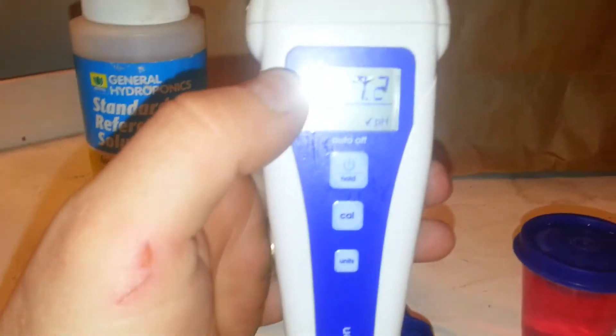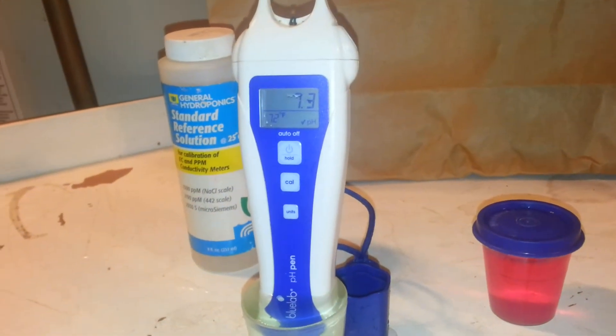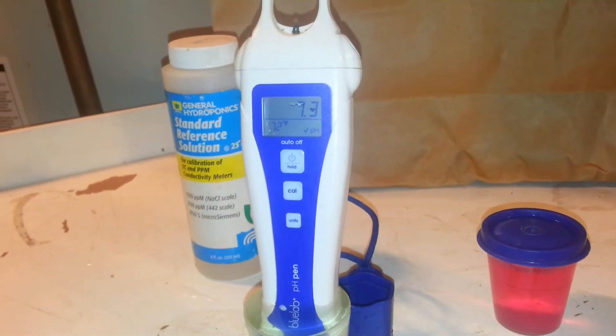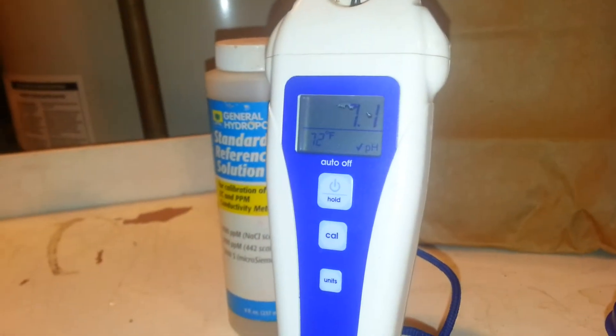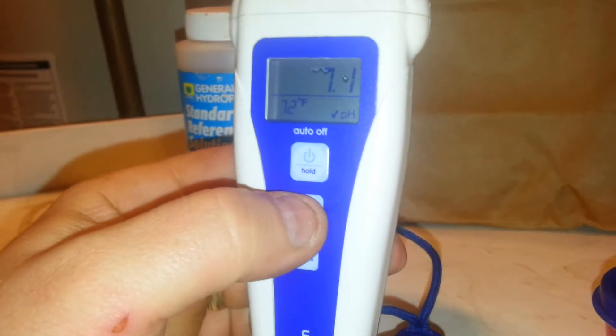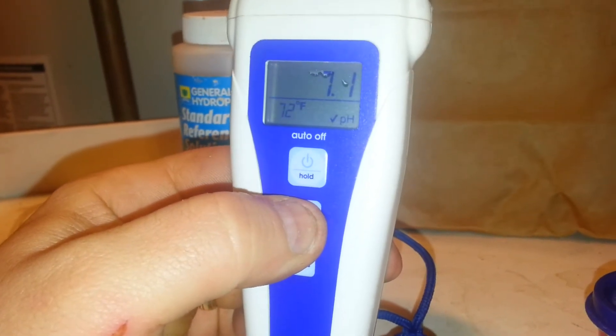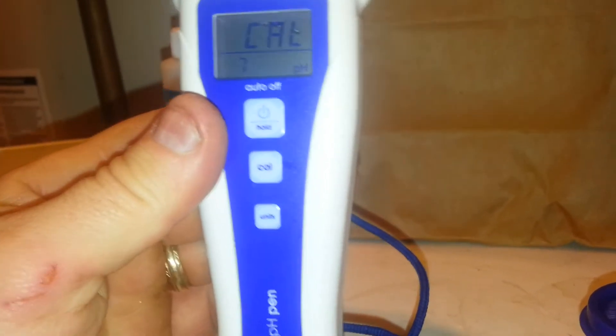Turn it on and put it in. I like to give it about a minute, and then I'll do my calibration by hitting the Cal button, and it should read accurate to 7. So you can see we ended up at 7.1, so we hold our calibration, we'll get our 7, and we're good.